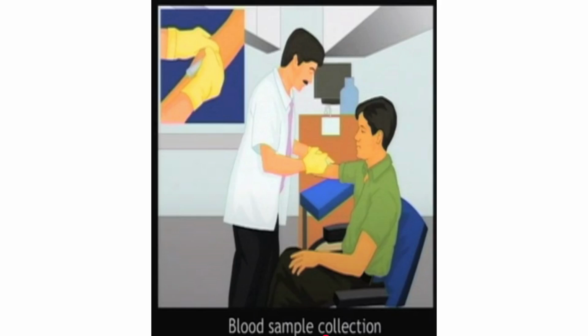Sir tried to give a realistic picture of how samples are connected and divided, and how an experiment can be performed using two-dimensional electrophoresis. Sorry, using the 2D differential in-gel electrophoresis, DIGE, technique.